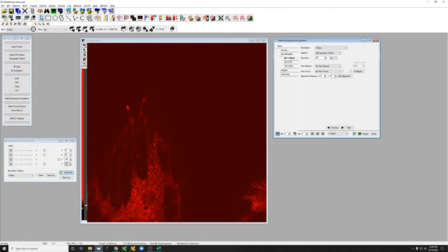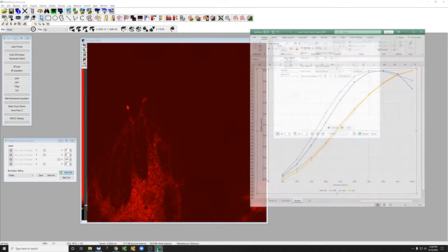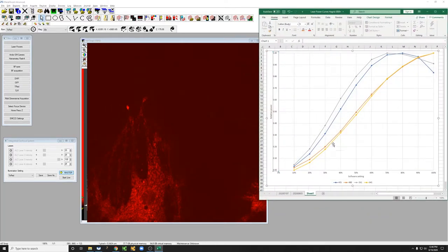Now unfortunately these numbers, even though they're expressed as a percent, don't correspond perfectly to a percent of laser illumination hitting the sample. Rather, they follow the relationships shown here.